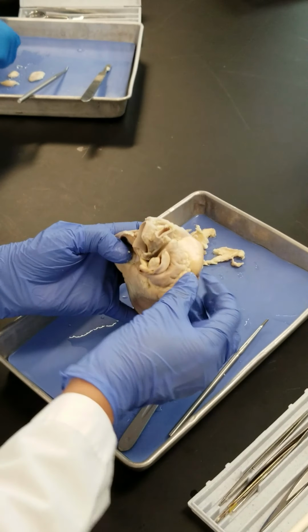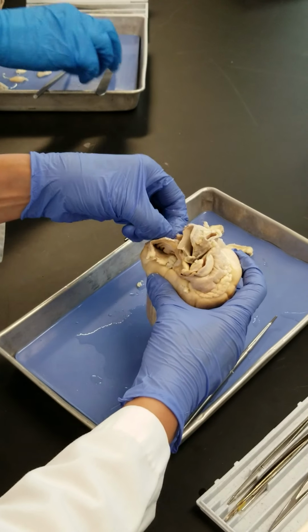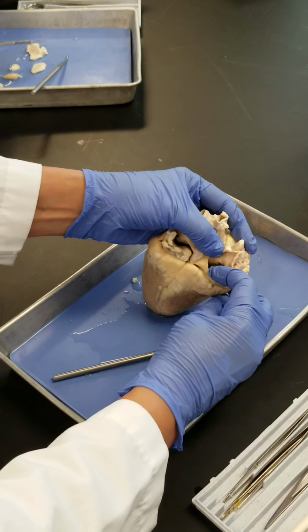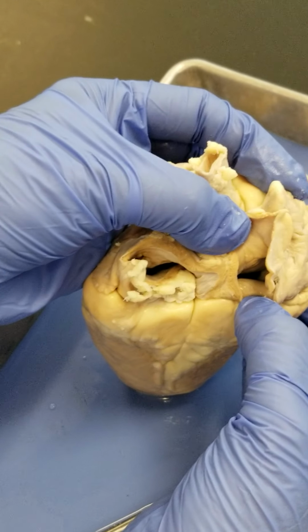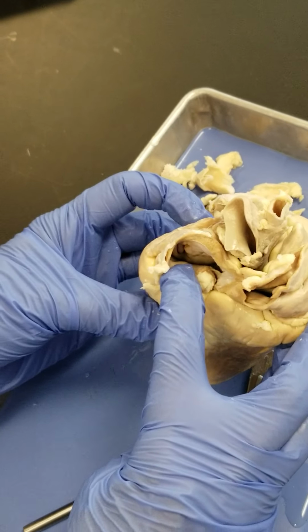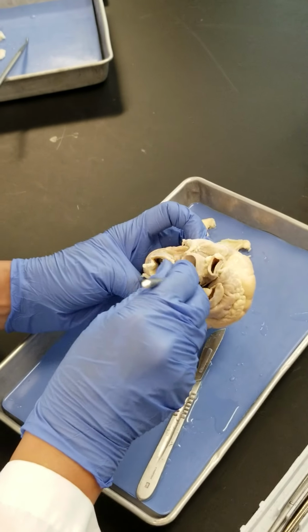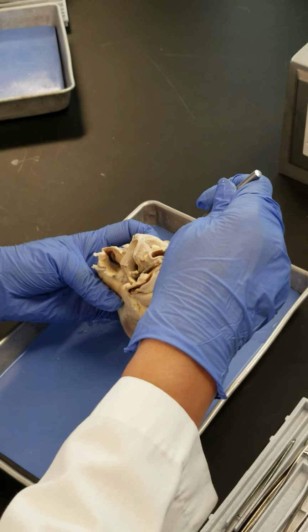So here you saw the auricle. This is the auricle of the right atrium, auricle of the left atrium. Then if I open it, you see the cavity of the right atrium here. Cavity of the right atrium, and this one, the cavity of the left atrium, right? Now, we said that we had the pulmonary trunk here. Then we had the aorta, aortic arch, and this first branch, the brachiocephalic trunk here.